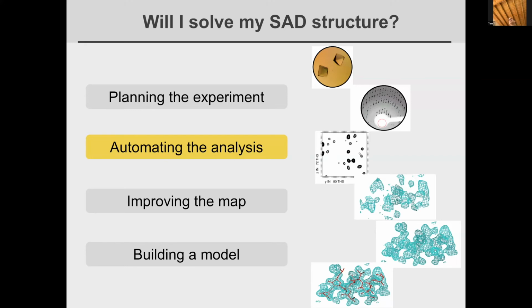Then you may measure the same data over and over again very precisely, but whatever errors are in that data might be replicated each time. For example, some reflections might have a high absorption and they might be measured inaccurately. So systematic error refers to error that if you measure the same data twice, you get the same wrong answer. And non-systematic errors are errors which, if you measure the same data twice, you'll get a random variation around the true answer. So these have two very fundamentally different properties.